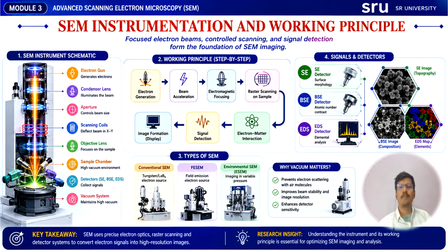Vacuum prevents electron scattering, that improves the beam stability, enhances the resolution and increases the detector sensitivity.